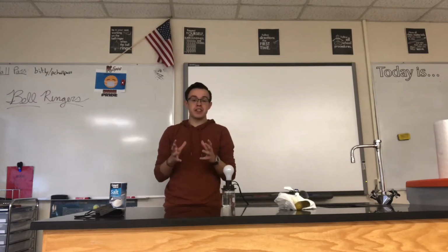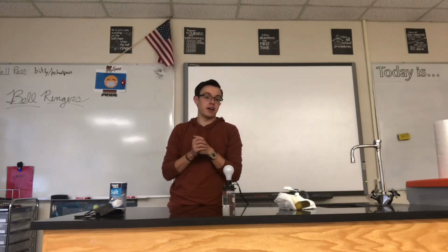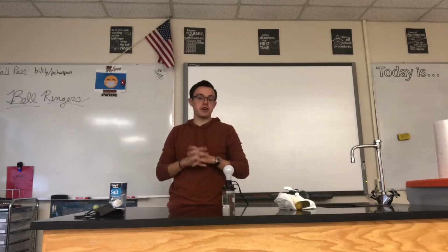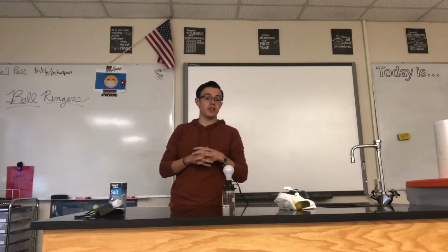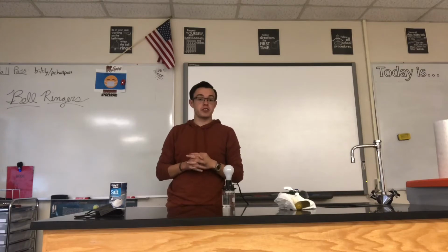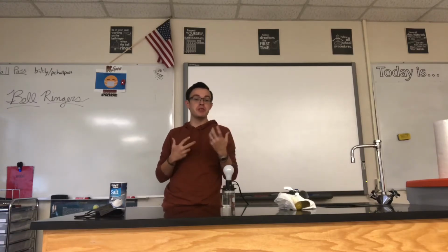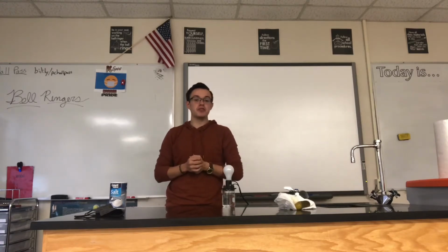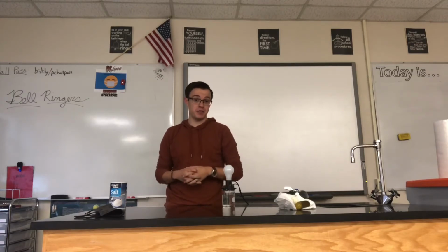So for this activity, I really just wanted to pique your interest about the characteristics of ionic compounds, okay? So I want to ask you a question real quick. Does water conduct electricity? I'll give you a second to think about that. And don't go Google this because I don't want any spoilers, okay? Just think about your own prior knowledge, your own experience, maybe what you've seen on movies and TV. Does water conduct electricity? Okay, well, we're getting ready to find out.